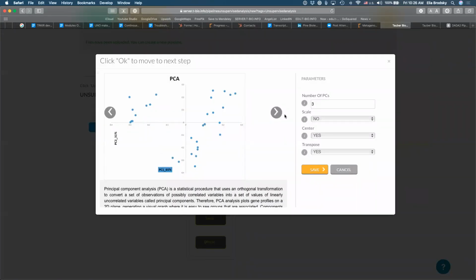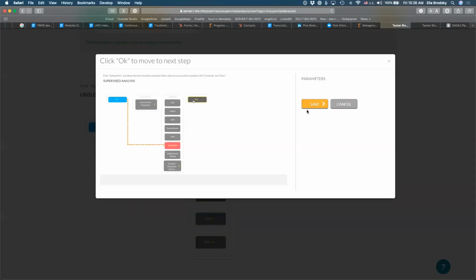And what is principal component analysis? Principal component analysis is what we just saw. It shows us the variability between samples based on all the information that we provide. When we look at the information that we have, the information is rich. There are a lot of features, a lot of characteristics, a lot of OTUs, over 300. It's difficult to visualize it that way. How do we summarize the data without losing a lot of the data, but really looking at one aspect of the data? The aspect we're looking for is variability between samples, all the samples. So let's click here on yes and press on end.